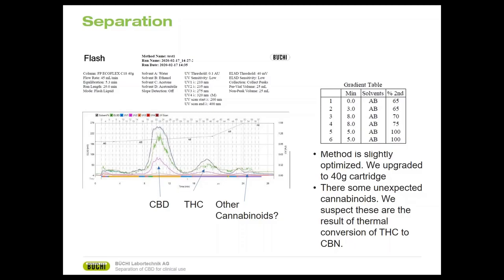Because again, in the beginning of the 70, 71, you start to get the THC. So once you go slower in this case, you will have much better separation. And this is exactly what happened. You can see the CBD peak is perfectly separated and selected, and it is completely removed from THC. I'm 100% sure there's no THC in the CBD because the separation is very good. And you can also see the THC peak.